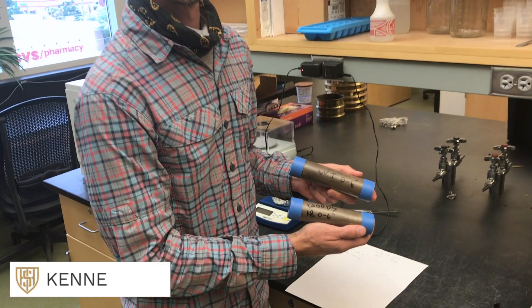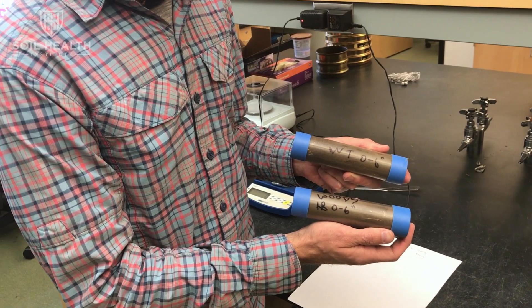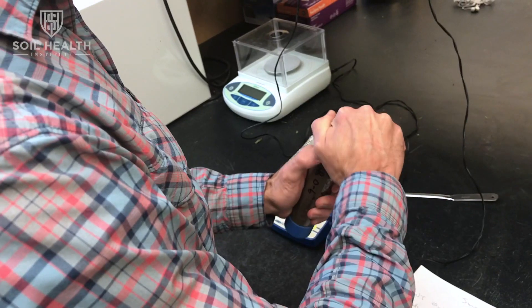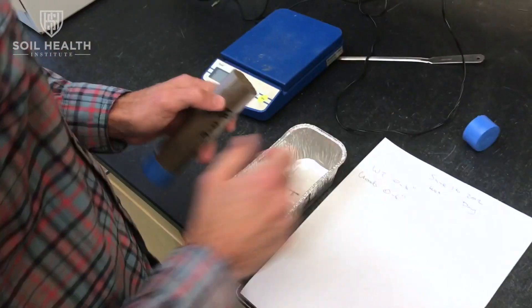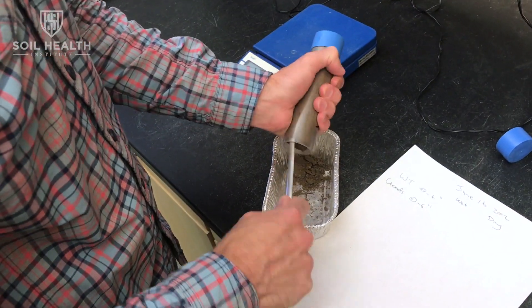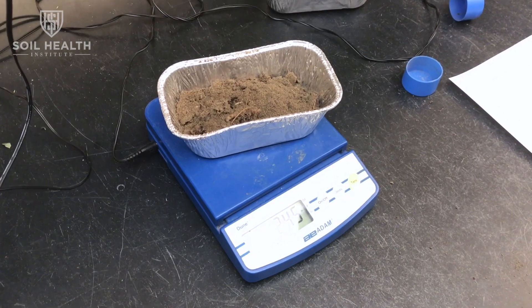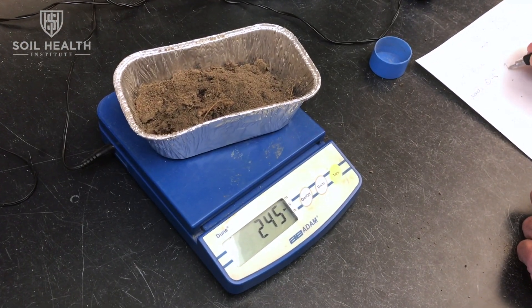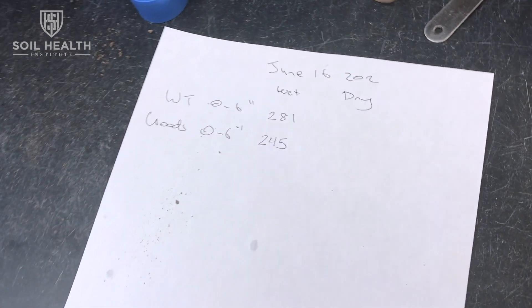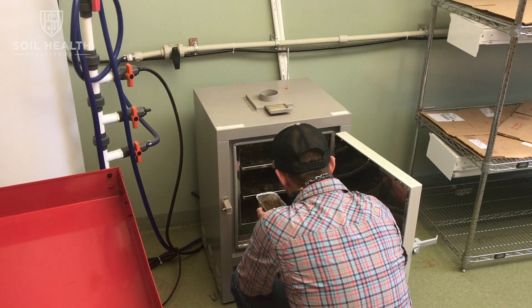This is my postdoc Gabe, and these are the wheel track and wood samples that Gabe is going to weigh and then put in the oven. We decided to only use the zero-to-six inch samples because the six-to-twelve inch samples weren't taken properly. He's going to put these in the drying oven and dry them for 24 hours at about 220 degrees.